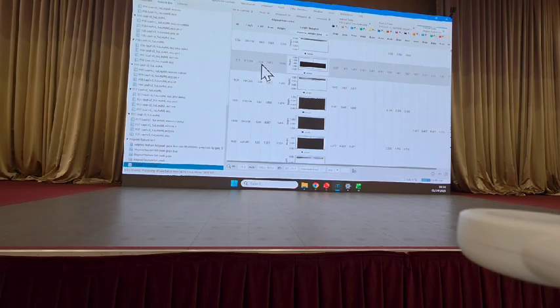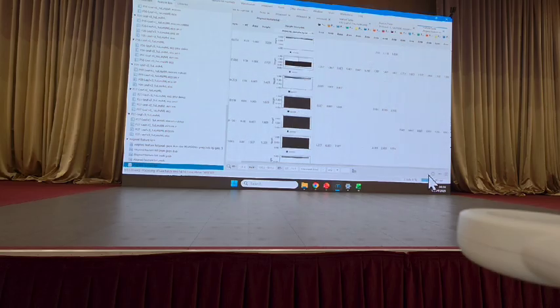So you can see right here, this metabolite at 1.24 minutes is found in every sample at around the same intensity, 2E7, 1E8. If I see something like that, I'd probably think one of two things. Maybe it's a primary metabolite found in all Piper species, or maybe it's some background contamination that was just accumulated during the sample processing.